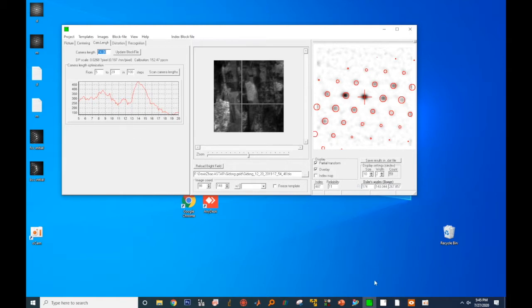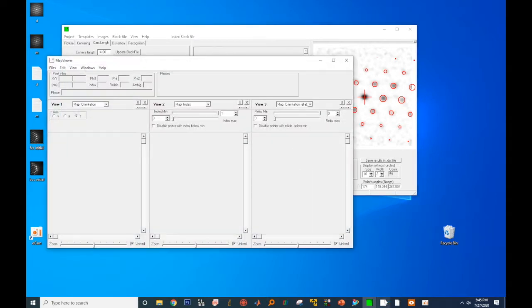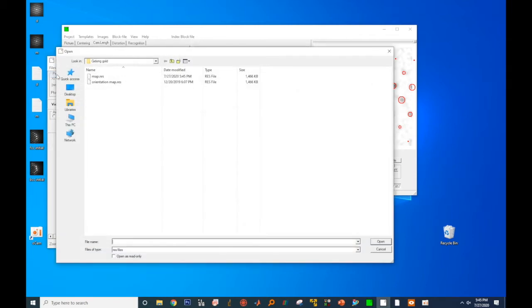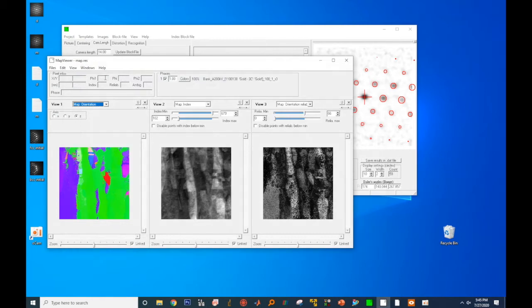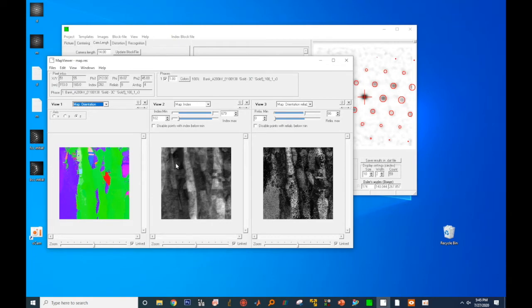To visualize results, you click on the Map Viewer icon, then click on Files, and open Results File, then select the result file you have just generated. By default, there are three viewing windows, so you see three maps. Let's go through the maps one by one.